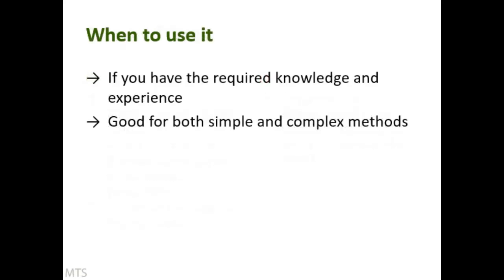Now, I think in terms of when to use it this time, if you have this knowledge and experience, go for it. If you think you've got quite good experience, but you're not sure you're ready, have a go. If you've got availability here, if you are able to use that software. And the benefit is that you don't have to make it really complicated. So you could do quite quick DOEs to prepare very simple methods, or you could do much more involved and complicated DOEs to do really complicated methods. So it has lovely flexibility if you are able to use it well.